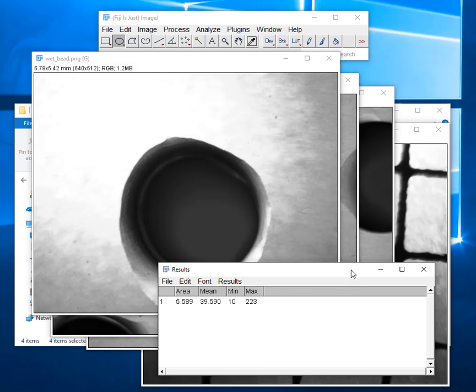So if you do this for all your beads you'll be able to figure out the area and then we can use that when we do our diffusion results later.